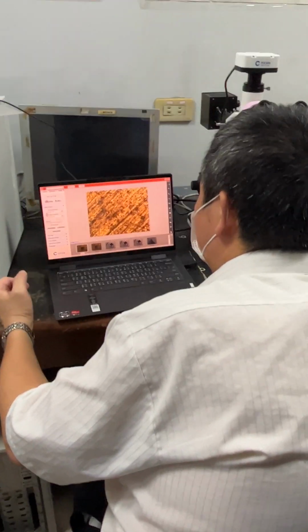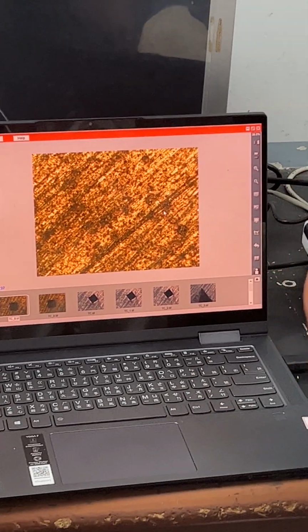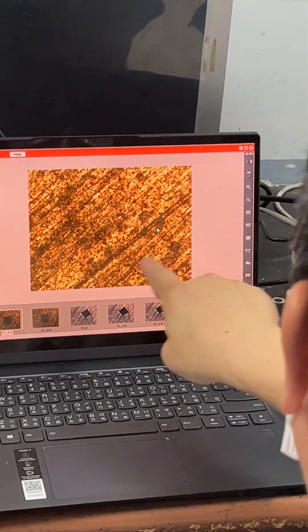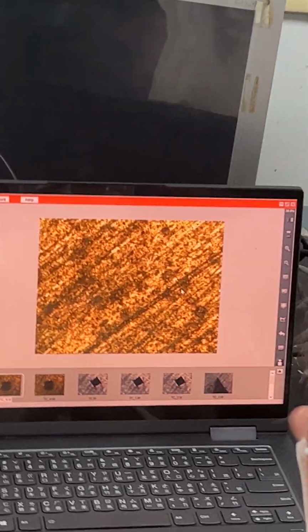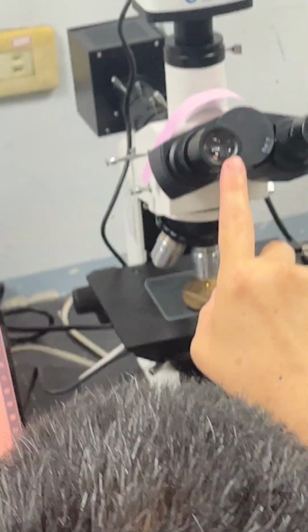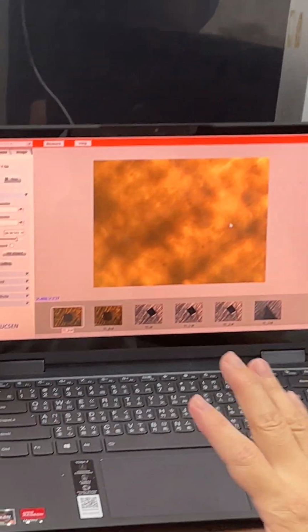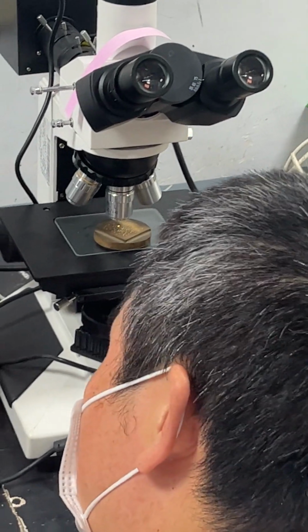Right? Okay, this is for 10 times 10, 100 times of magnification. And we may make it even more, which is this one. For this one, this is 20, this is 10, so this is 200 times. As you can see, it blurs again.